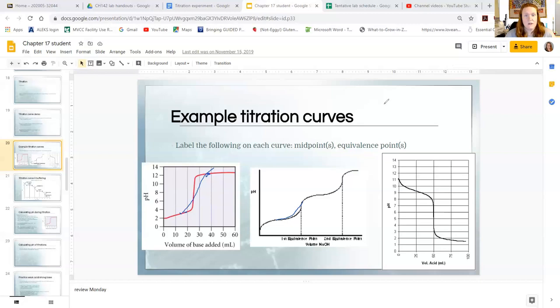You're going to be doing three titrations in total, one rough for your first one. This is also going to be a little bit different because when you measure the pH, you want to make sure the solution is really, really homogenous. So what you're going to do is set up a stir plate, which is a hot plate, but you're not going to use the hot part.